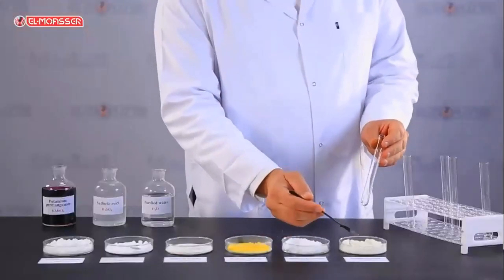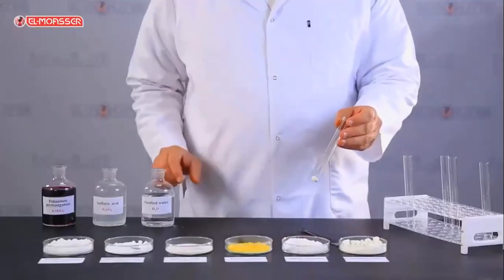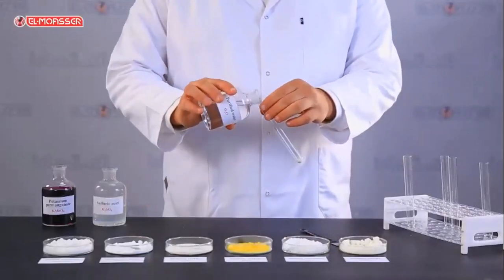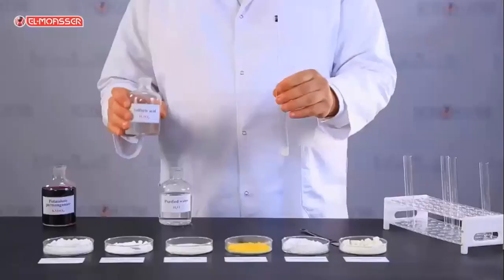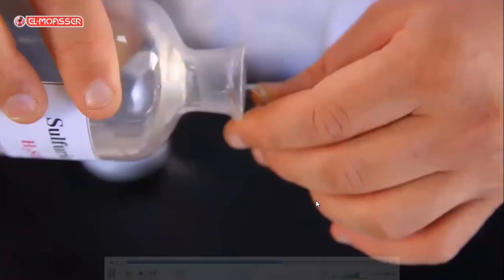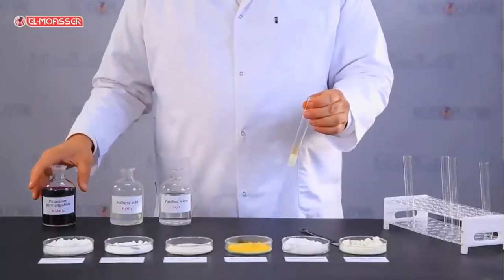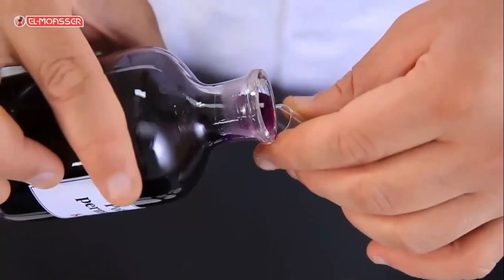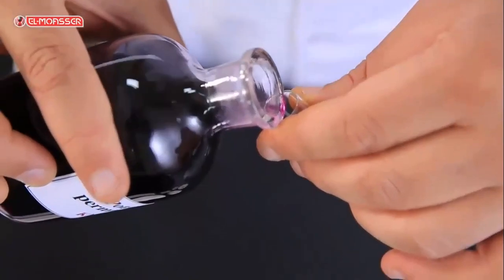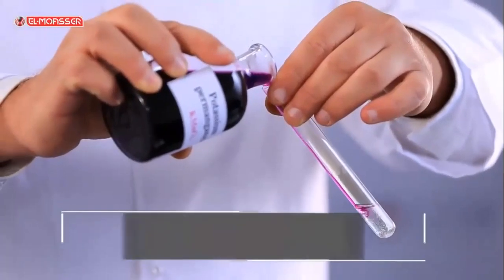Confirmatory experiment. Add a small amount of sodium nitrite salt to a clean test tube and add distilled water with shaking to form a salt solution. Then add to it acidified potassium permanganate with concentrated sulfuric acid. What do you observe? The violet color of potassium permanganate disappears.